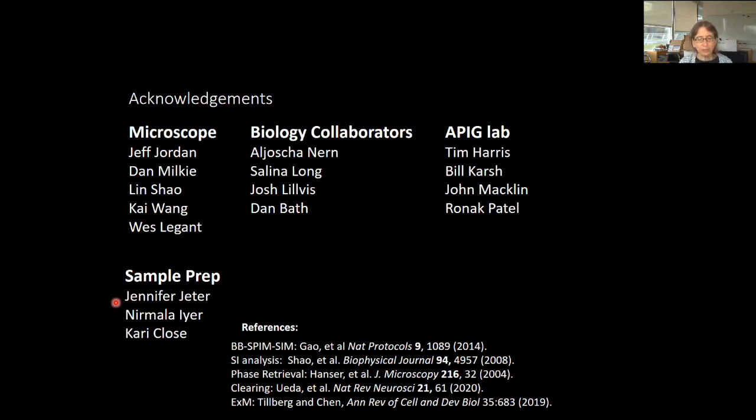What structured illumination is going to do is it's always going to boost your resolution. If you have a sample that is fundamentally low signal to noise, then you're not going to be achieving the resolution all the way out to the limit of your detection objective. Doing structured illumination will actually boost your ability to see resolution that's within the nominal limit of your detection objective, even when it can't get all the way out to the ultimate resolution that your illumination could get you.